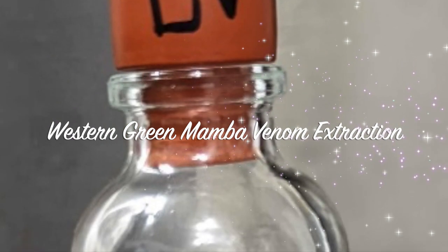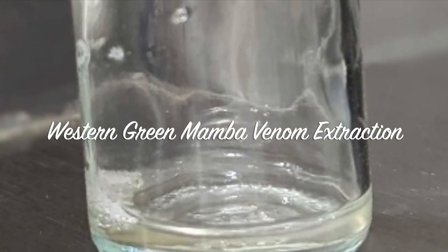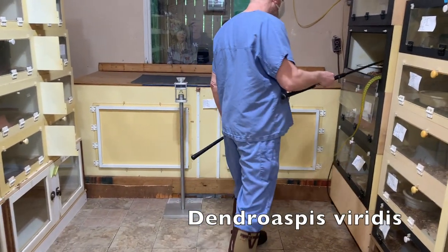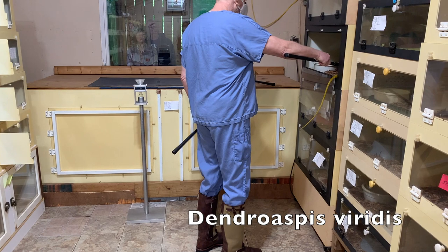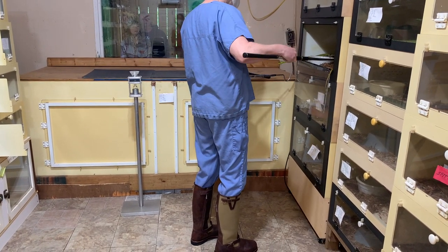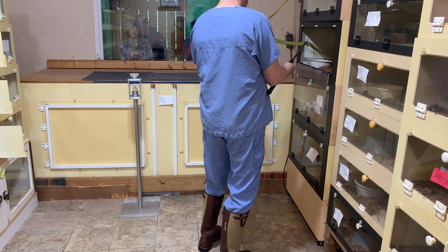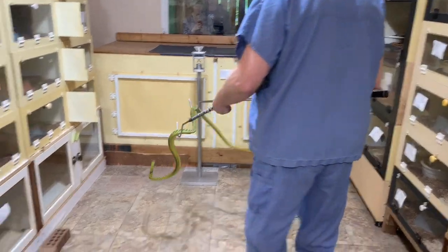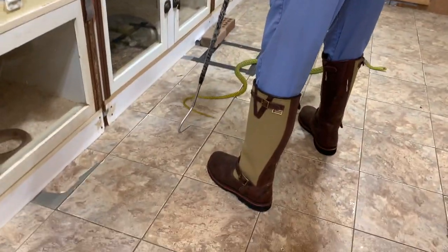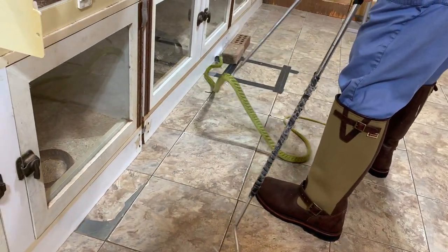Welcome to today's video on Western Green Mambas and venom extraction. The scientific name of the snake is Dendroaspis viridis. These are absolutely gorgeous snakes with really interesting scalation where each scale is a little bit individual and different, and you can see their bright green color.